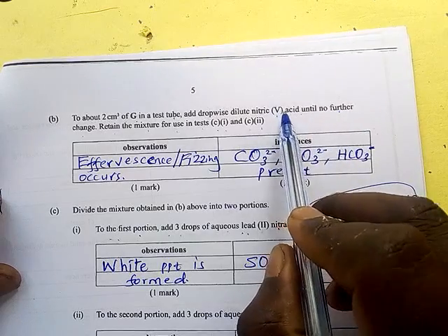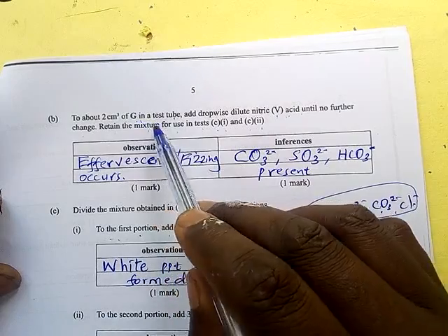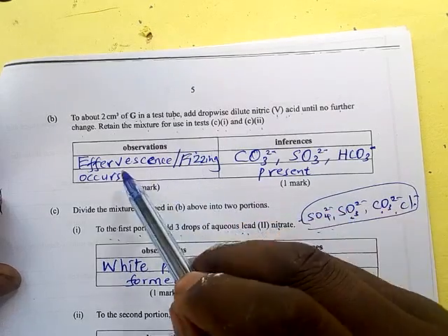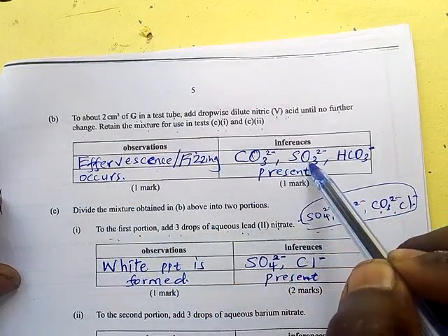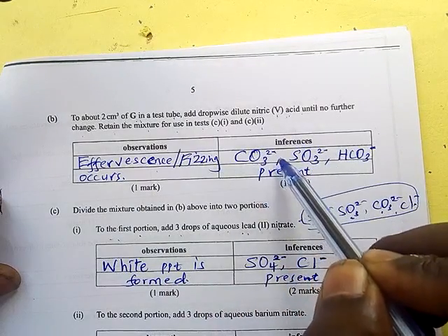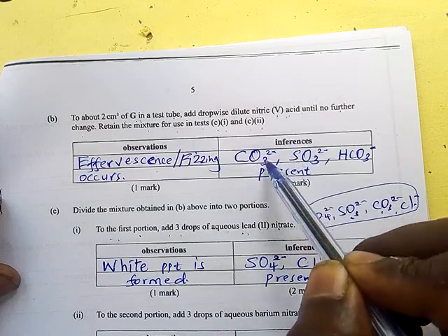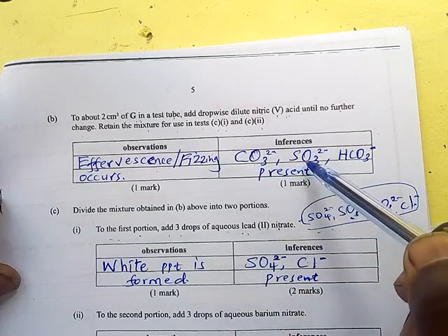It means that the acid that was added into this solution G was in excess. So some acid could have remained inside. So that acid that remained inside, if there was a carbonate and a sulfite, it reacted completely to form a colorless solution. And the colorless solution now does not contain the carbonate, does not contain the sulfite.